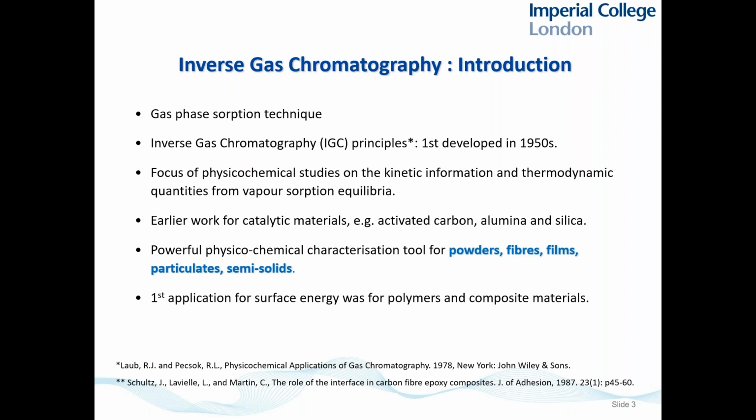So firstly, inverse gas chromatography is related to normal analytical chromatography, which we'll talk about in a moment. It's a technique for characterizing surface properties of solids. It's not an analytical method. It's a method used to characterize the surface properties of solids. It's not a new technique. It's been around for a very long time, since the 50s.